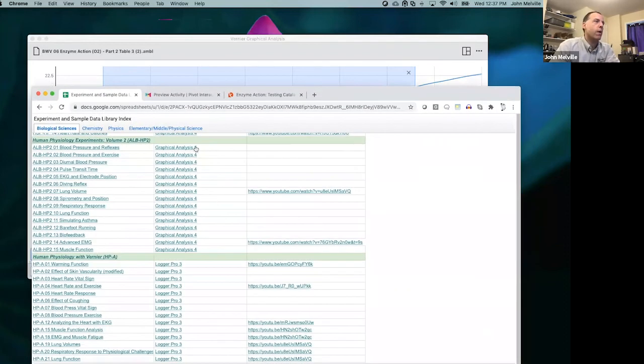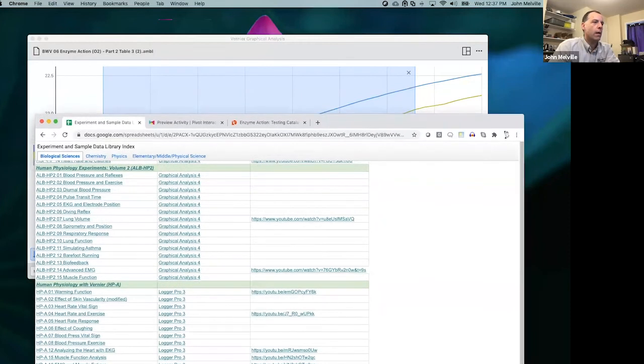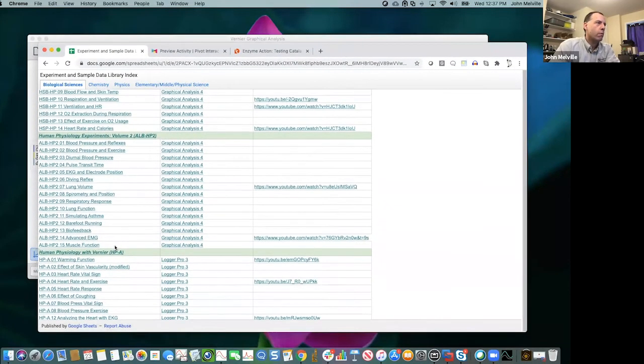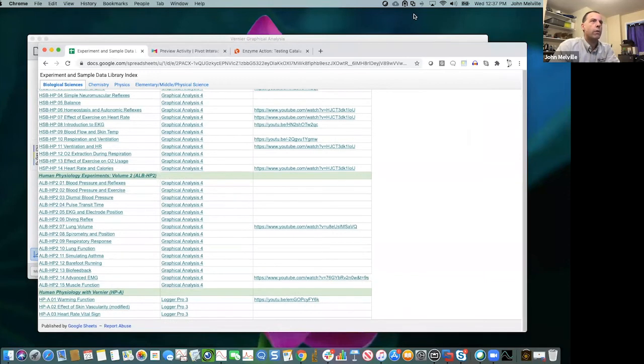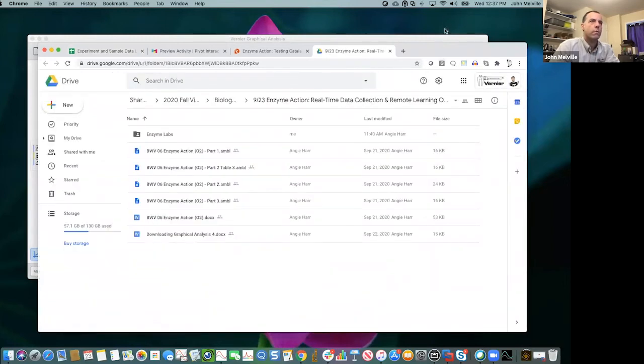So this other run that you have access to in the sample data, let me go back there. Hold on. Let me find out where that was in the chat. Hold on. There we go. So if you take a look at here, part 2 is actually all of the temperature data. So I went and did all of the runs at all the different temperatures. I didn't do 3 of each one, but I got 1 of each one so that you could use that.